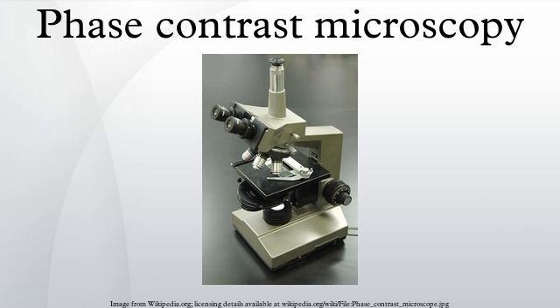Phase contrast microscopy is particularly important in biology. It reveals many cellular structures that are not visible with a simpler bright field microscope, as exemplified in Figure 1. These structures were made visible to earlier microscopists by staining, but this required additional preparation and killed the cells. The phase contrast microscope made it possible for biologists to study living cells and how they proliferate through cell division. After its invention in the early 1930s, phase contrast microscopy proved to be such an advancement in microscopy that its inventor Fritz Zernike was awarded the Nobel Prize in 1953.